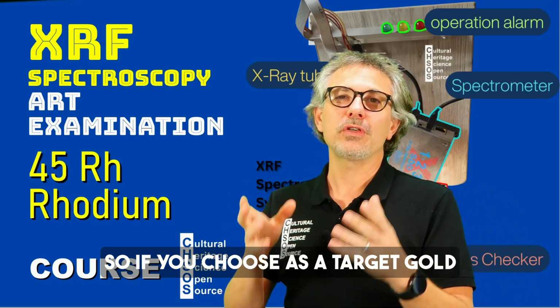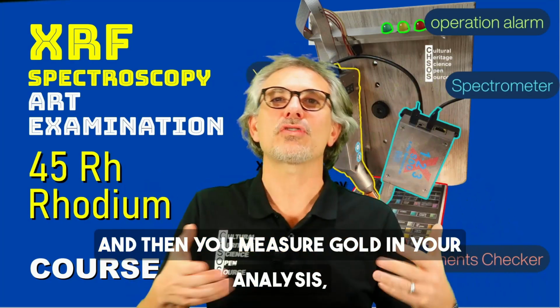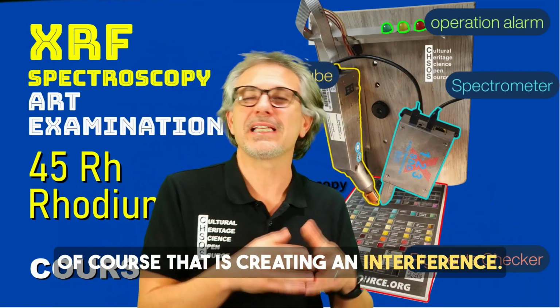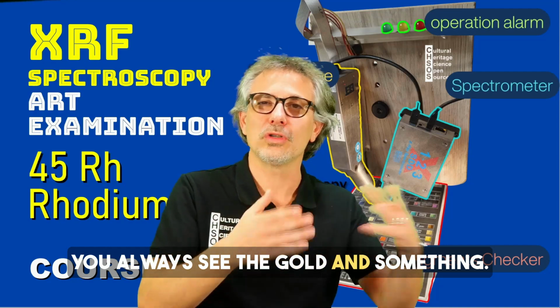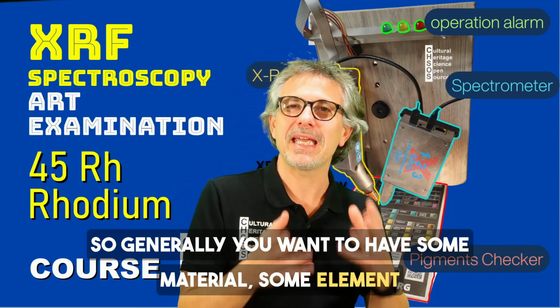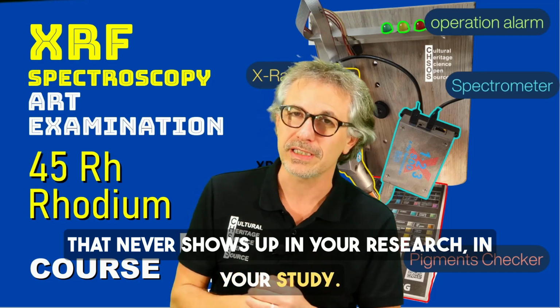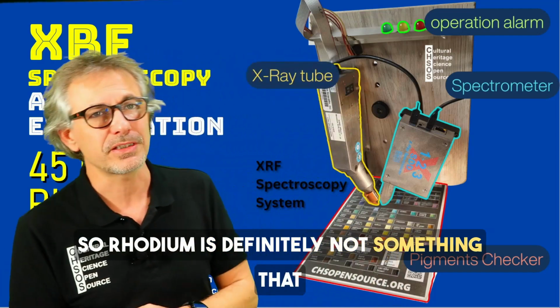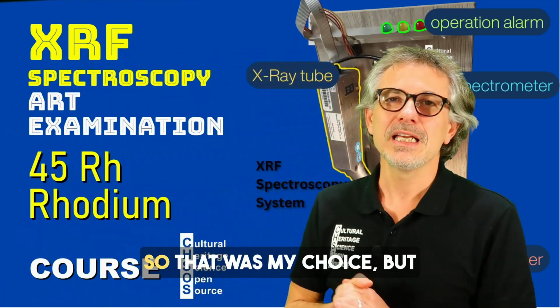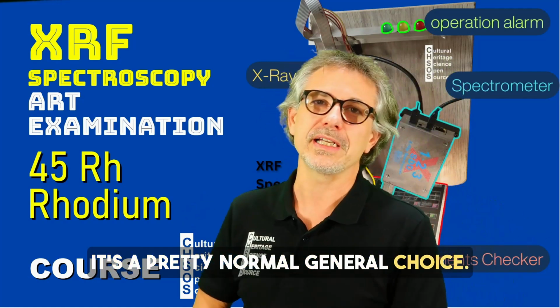So if you choose gold as a target and then you measure gold in your analysis, of course that is creating an interference. You always see the gold and something. So generally you want to have some element that never shows up in your study. So rhodium is definitely not something that we will find in pigments analysis. So that was my choice, but it's a pretty normal general choice.